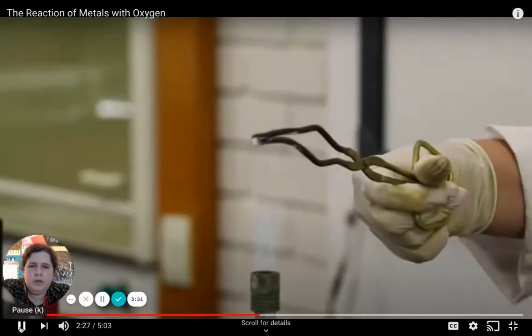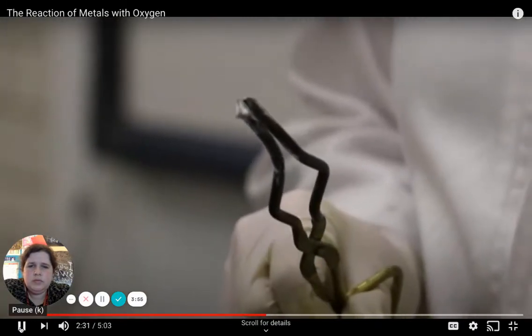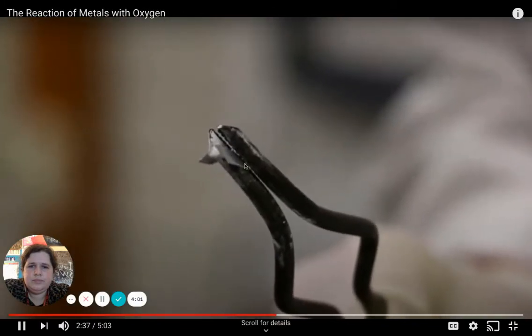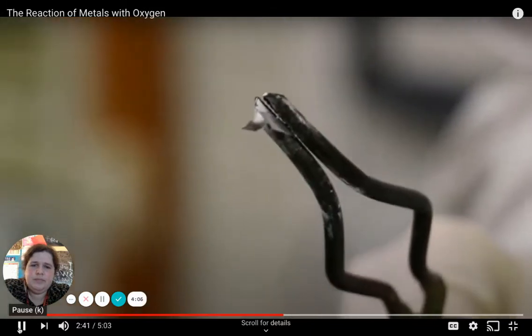This is the same aluminum foil that you would be putting on your food. Do you see the bit that's been in the Bunsen burner flame? Do you see how it's not shiny anymore? Now it has a coating of aluminium oxide. Aluminium oxide is an ionic compound and therefore isn't shiny.